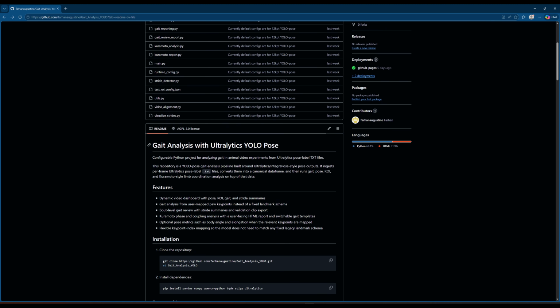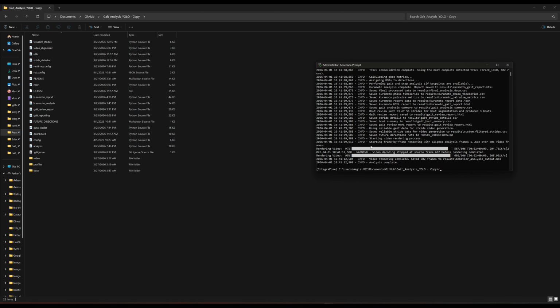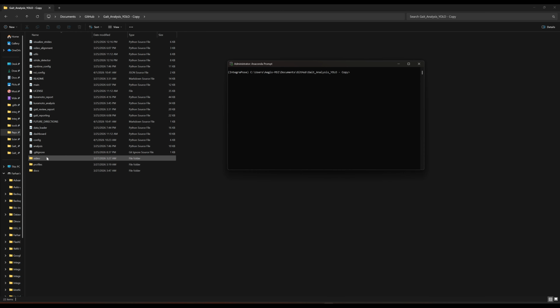Coming back to the Ultralytics YOLO-Pose, let's go over the code itself. So I've already ran this project once. This was to make sure that everything runs and that I'm not going to make a blunder out of this video. So what I'm going to do is I'm going to show you the video I'm going to run.